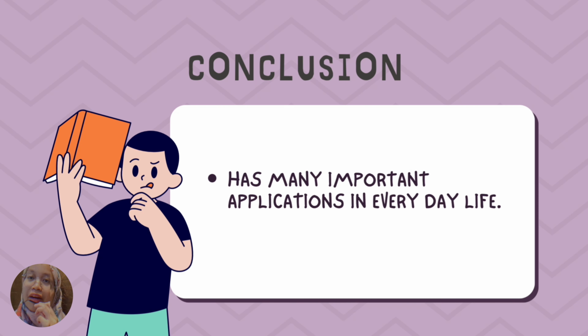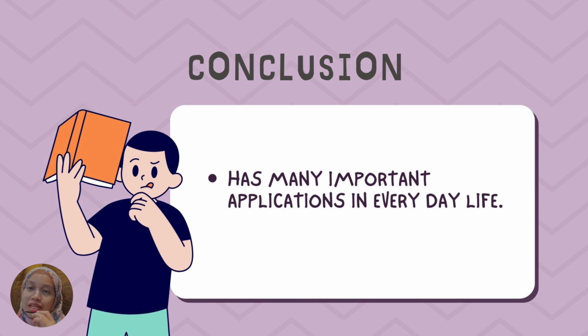To sum up, direct titration is the most basic titration, which is commonly used. In this type, a titrant of known concentration and volume is added to a substance in order to analyze it. Direct titration is usually used in daily life. Titration is not just an experiment you need to perform to pass chemistry in school. It has many important applications in everyday life.